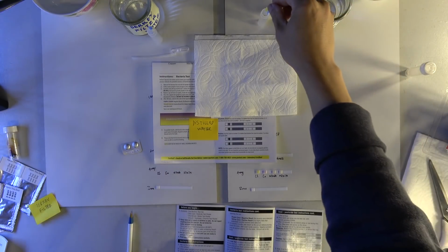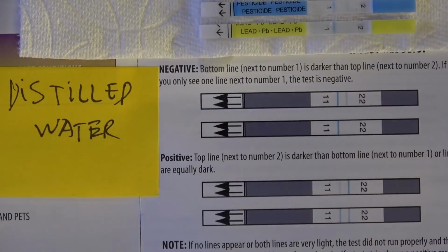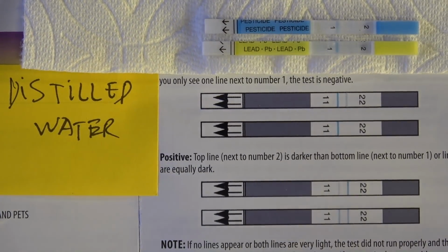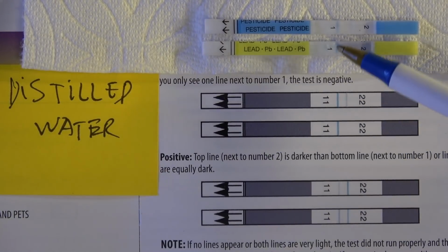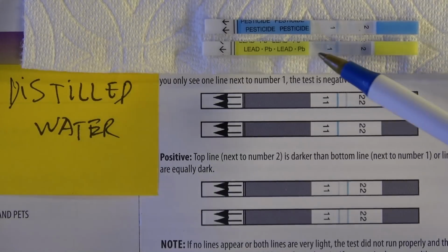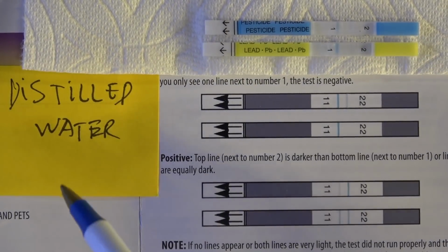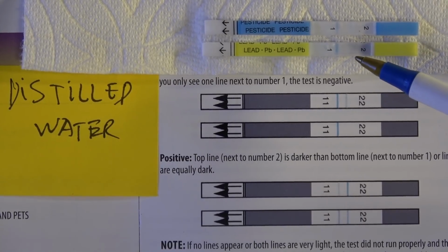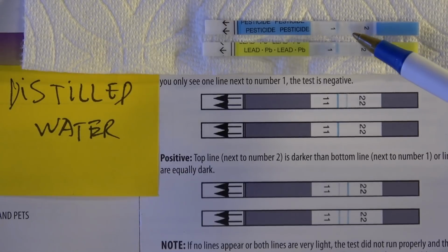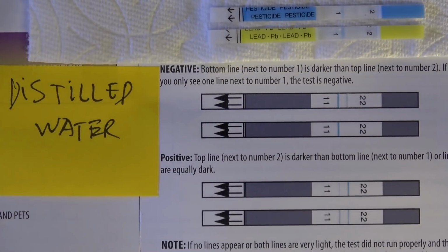Right, so now let's take the strip from the distilled water. Let's take a closer look here. Distilled water test strip. Move it down a little bit. Okay. You can see the blue line on 1 is dark, but the line on 2 is very dim, especially the lead test strip is almost invisible. So the distilled water completely removed it, has almost no trace of lead. The pesticide strip has a very thin and still very dim line on the top here that indicates that it's a negative, also a negative result.